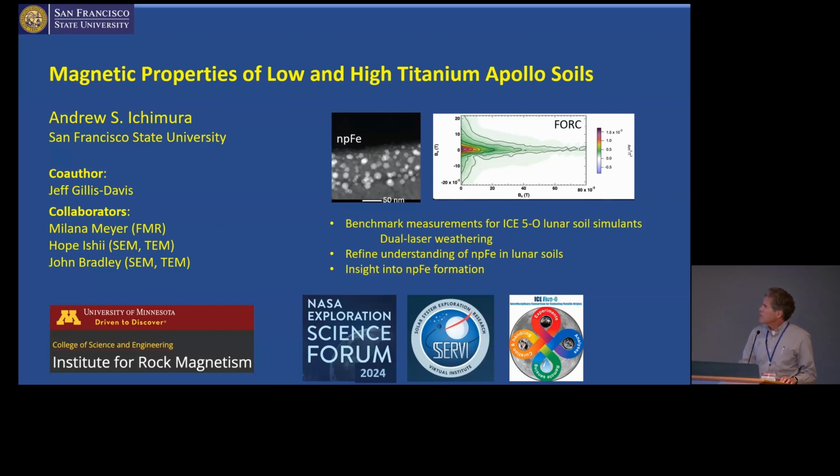In addition, I'm showing here on the right-hand side a first-order reversal curve, or FORC curve. And we're going to use these to help refine our understanding of the distribution of domains and grain sizes in lunar soils. And I hope to convince you that this relatively new method that was not available back in the Apollo era can provide a lot of new information about the lunar soils.